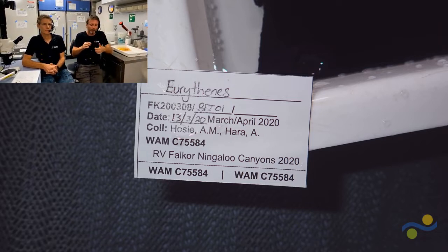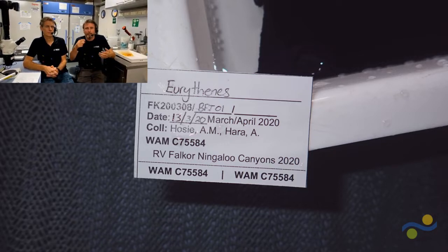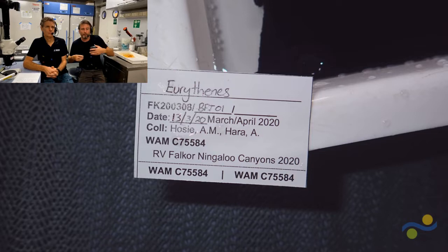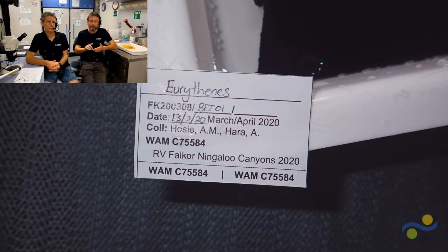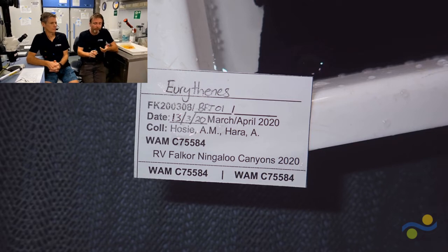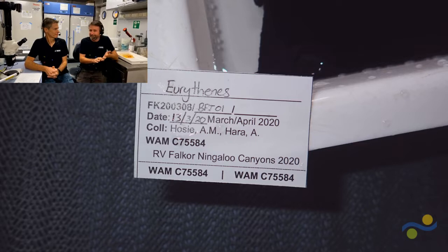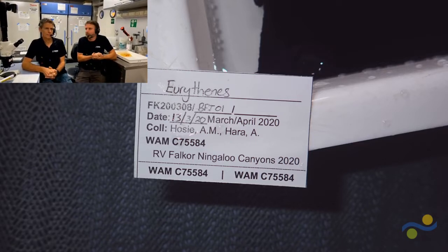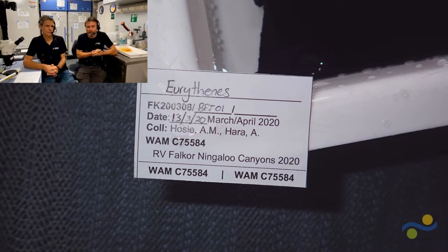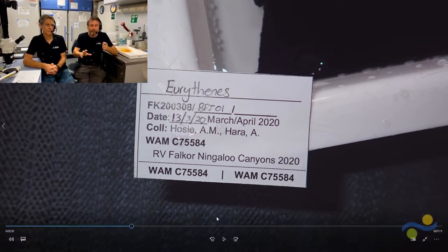So you can lose every other piece of information, but if you've got that C number, you will be able to link it back through our digital records, our field catch sheets, to fill out all the other information. So you can re-identify a specimen, however you can't re-figure out where it came from unless you've got that linked to the specimen in one way. So those numbers for us are probably the most important thing about keeping track of the animal, just having that number and having it linked through to everything else.